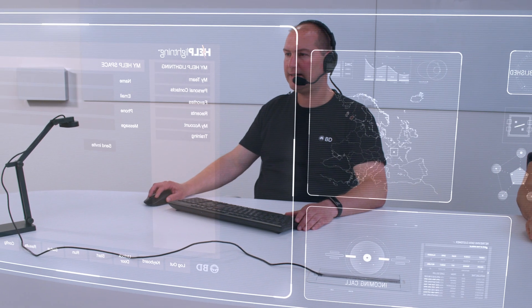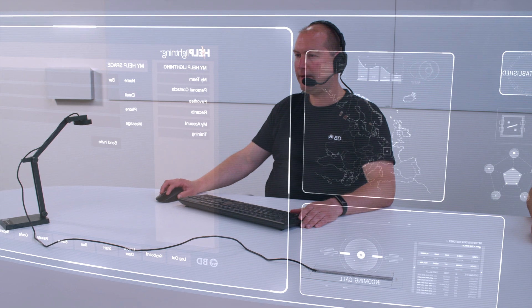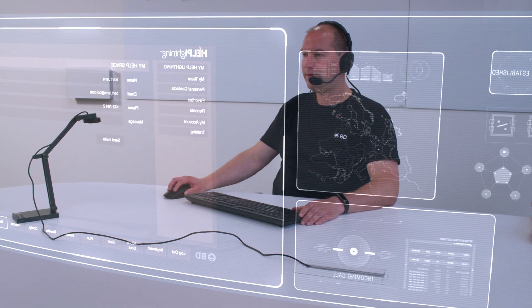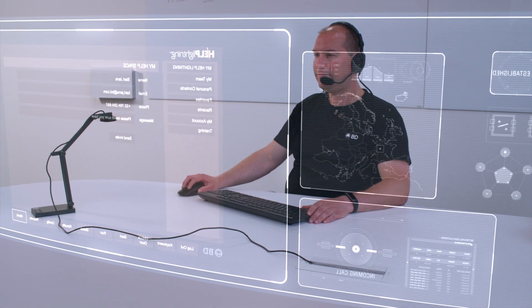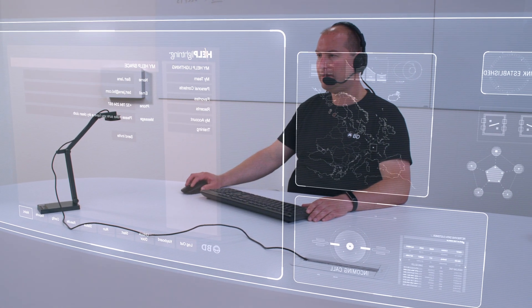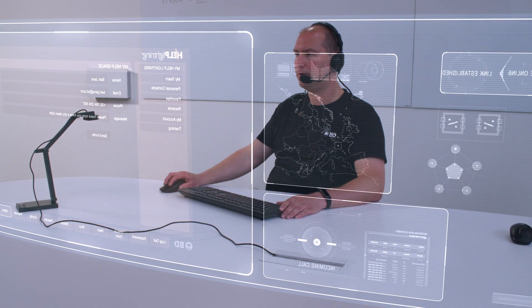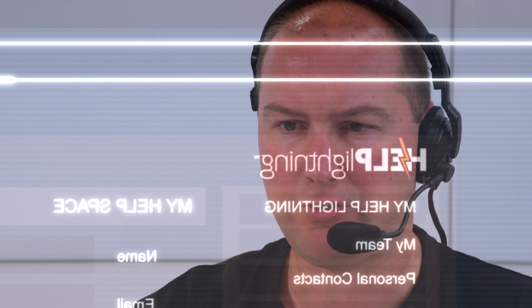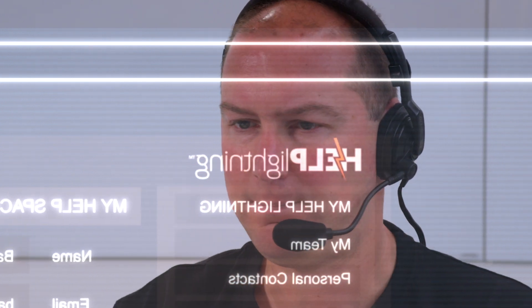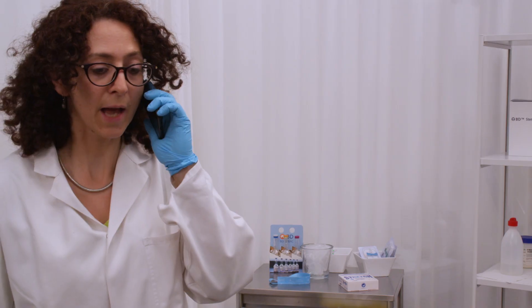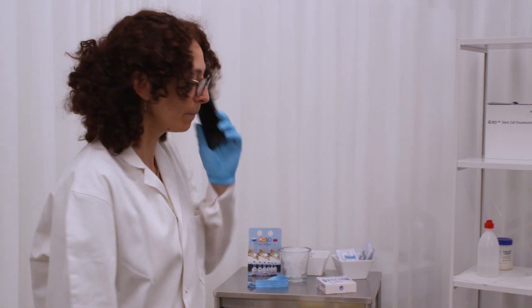Okay, no worries. We can guide you through it. I will send you a Help Lightning invite and then we can assist you remotely. Can you take a soft cloth damped in water in the meantime? Yes, of course I can. Thanks. Bye.